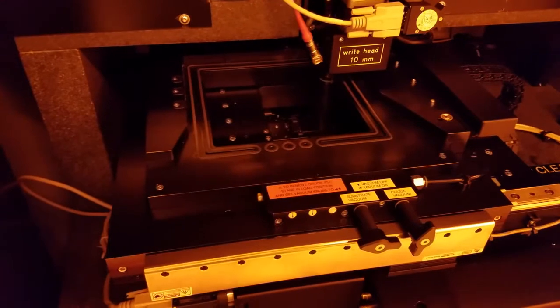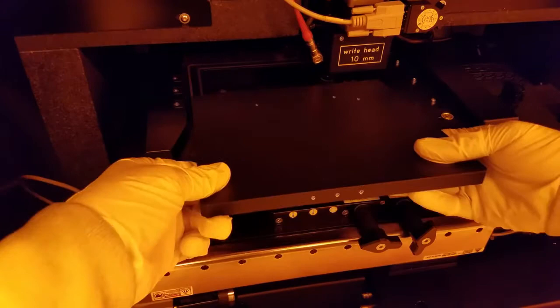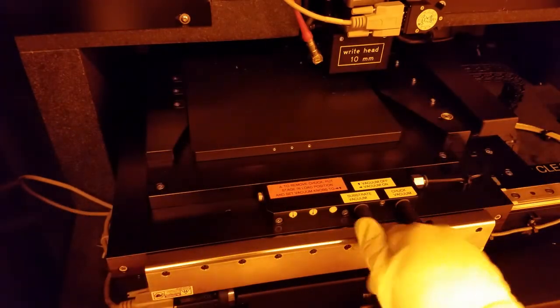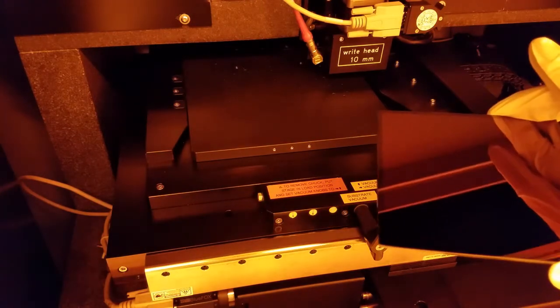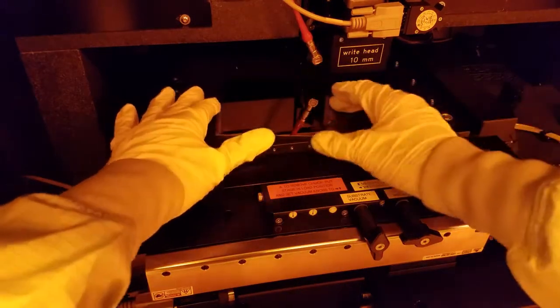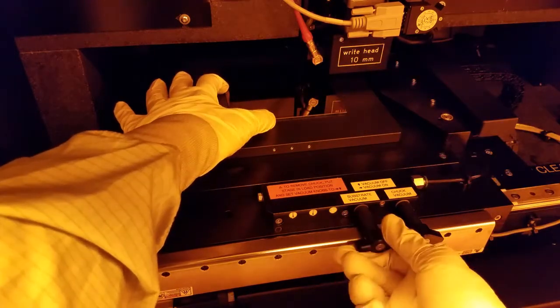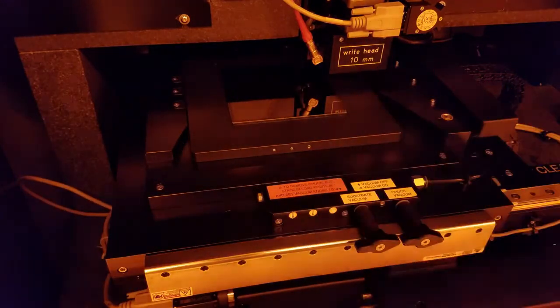Open the door. Put the chuck back on the stage and turn the knobs up and right. Put the sample on the stage and carefully slide it up against the pins and turn on the substrate vacuum. Also give it a little check to make sure that it's secured to the stage.